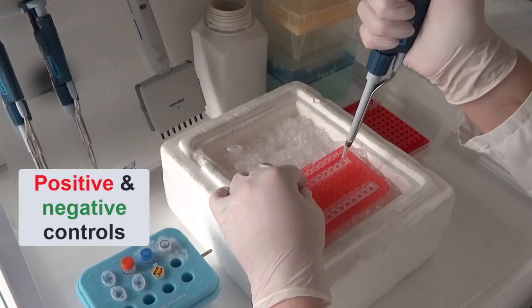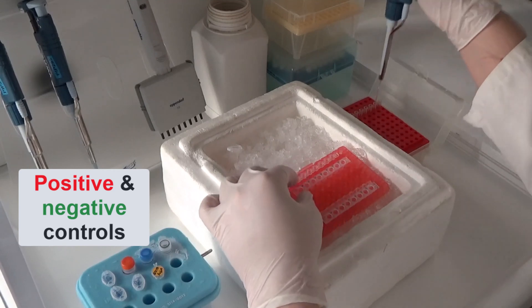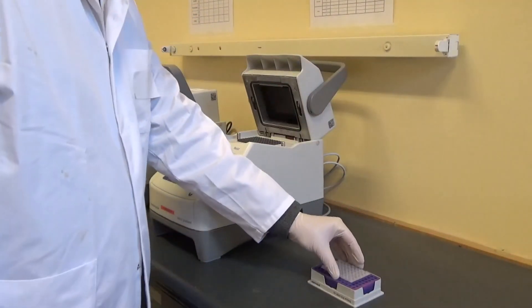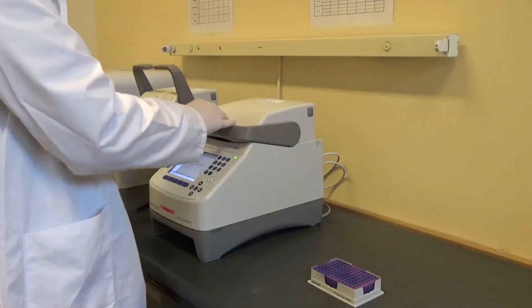Positive and negative controls are added for both the RT and PCR steps in order to ensure the validity of the detection test. Afterwards, the PCR plate is moved to the thermocycler room to run the PCR.